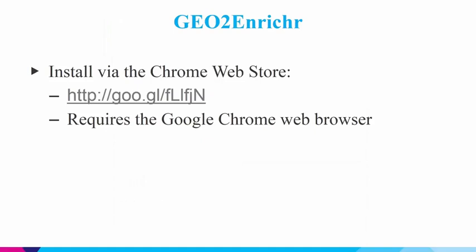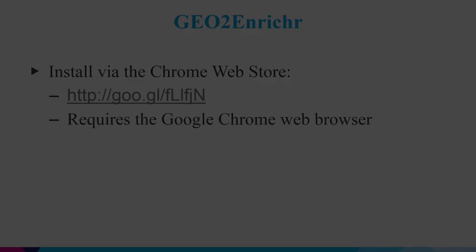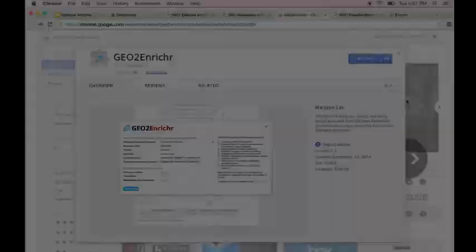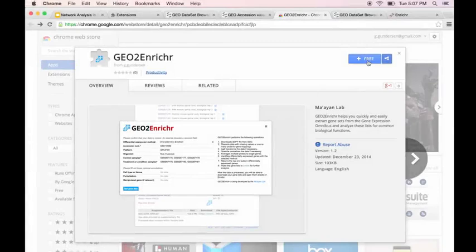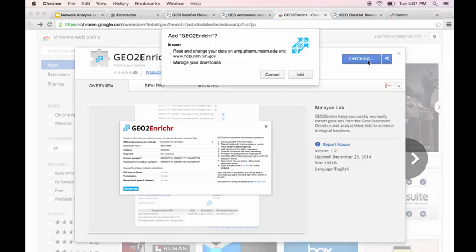Now I'm going to talk about installing and using GEO2Enrichr. So if you navigate to the Chrome Web Store using the link, you'll see this page here. So installation is as easy as just clicking this free button. If you click it, Chrome will notify you of some permissions that you have to accept. So just to explain those, first of all, we need to be able to make HTTP requests to amp.pharm.mssm.edu.